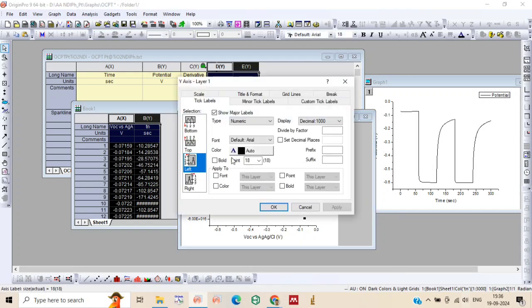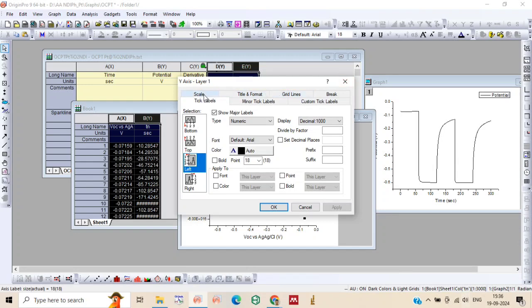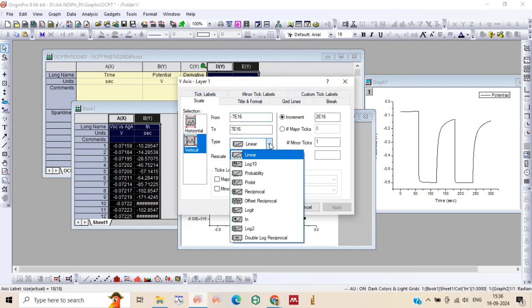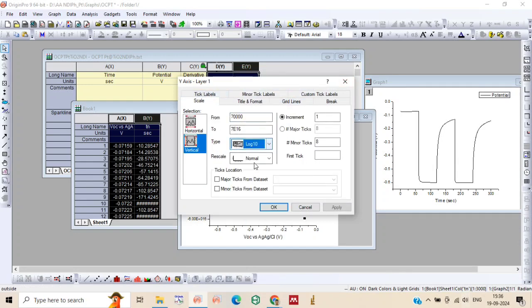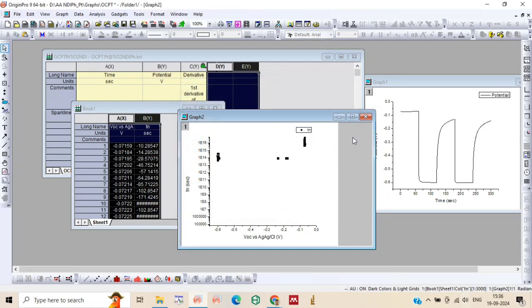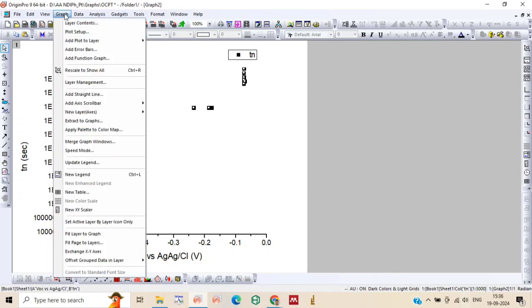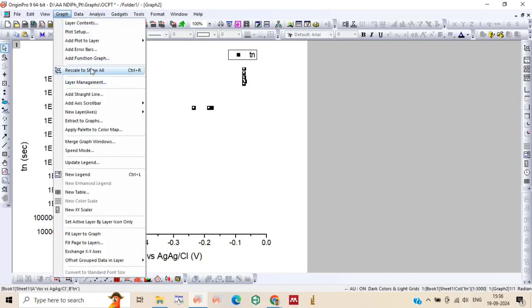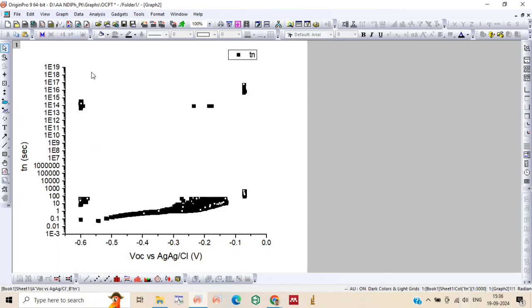Now just select it. Select the y-axis and take a log of y-axis. Now just select the point. Go to graph and to rescale option. And you will get this plot.